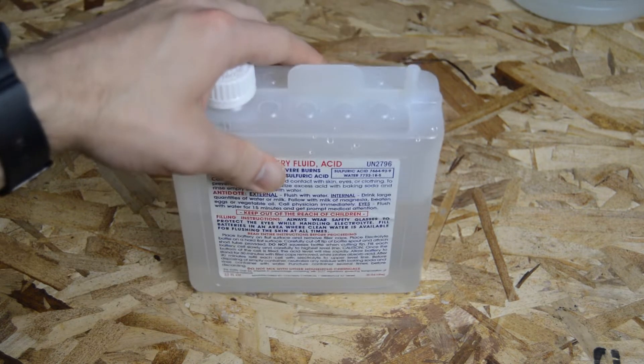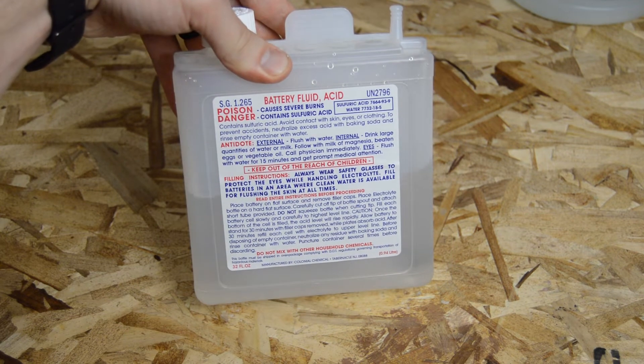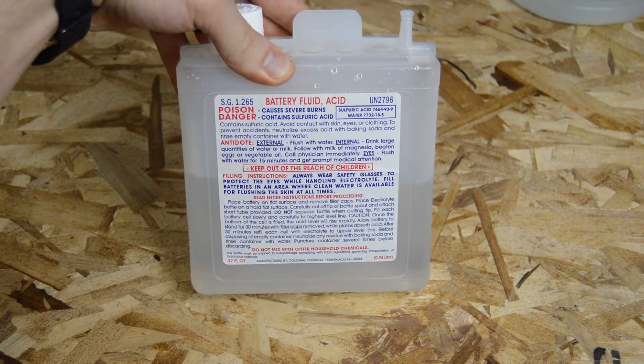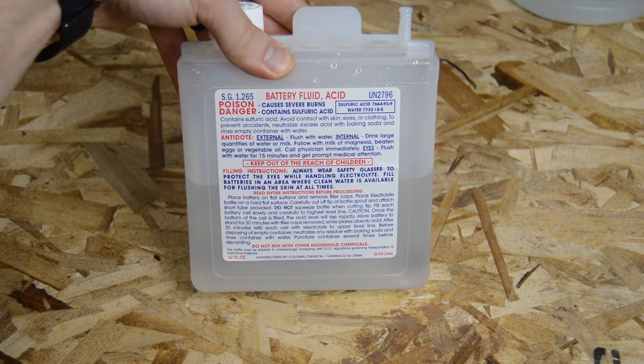I will also be using concentrated sulfuric acid in the form of battery acid. A typical concentration of battery acid is about 4 moles per liter of sulfuric acid. This acid will be the source of sulfate for the nickel sulfate crystals.